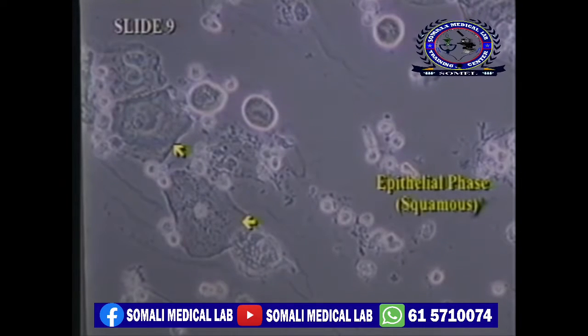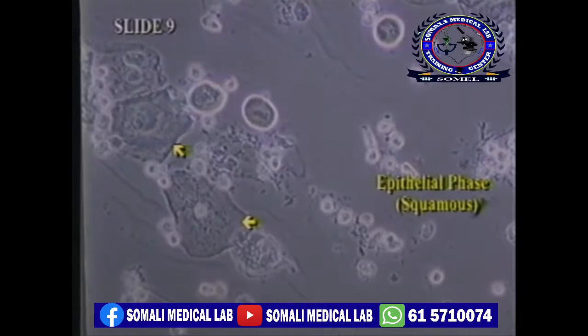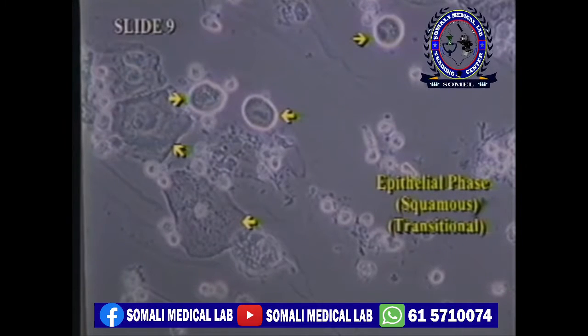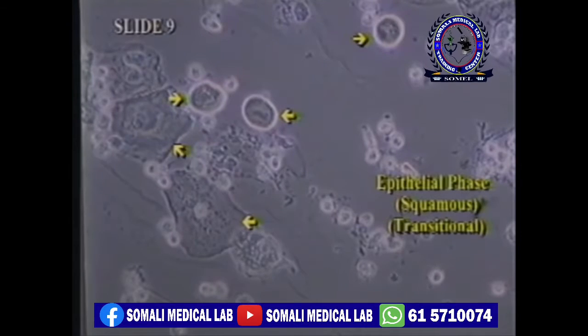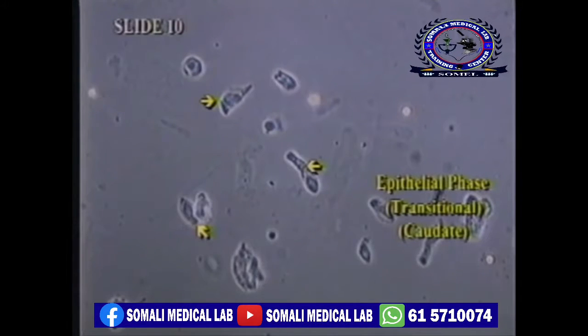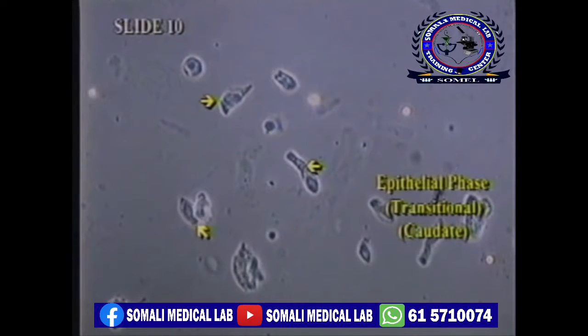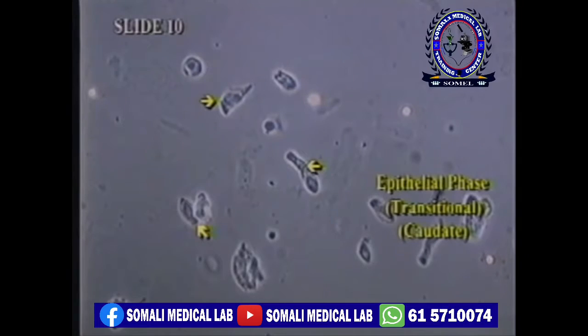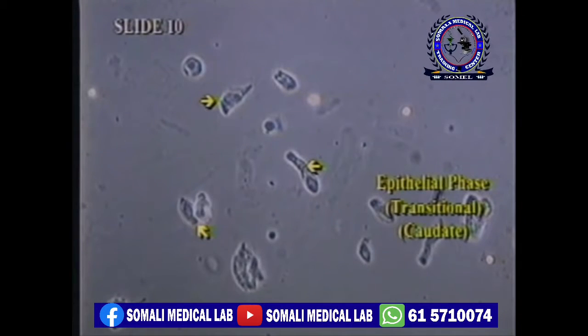These are the large squamous epithelial cells. The transitional epithelial cells are round, significantly smaller, with a centrally placed nucleus. Another type of transitional epithelial cell are these caudate-shaped cells seen under phase. They have the same significance as other transitional cells. They merely come from a different part of the urinary tract.